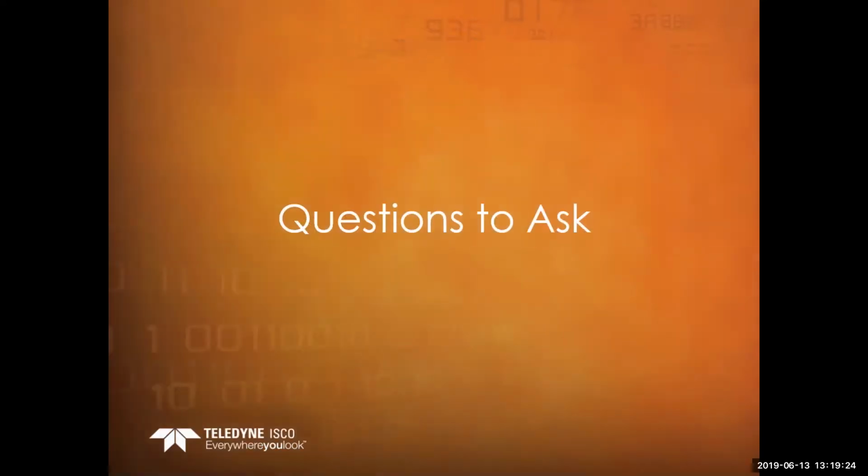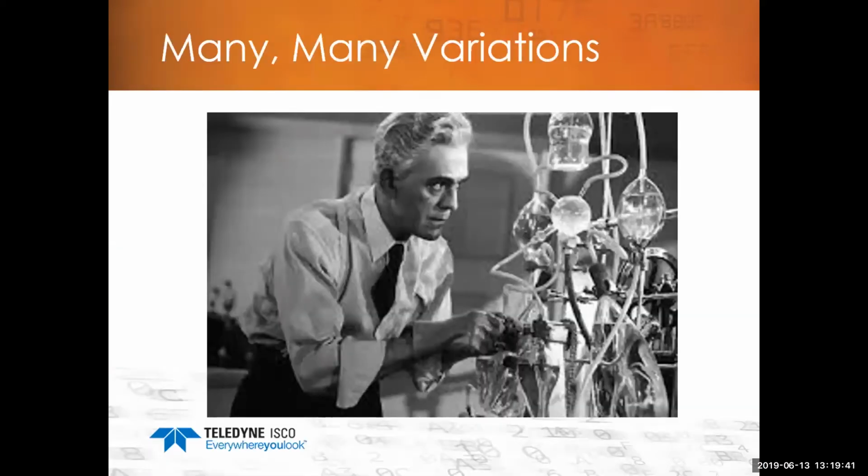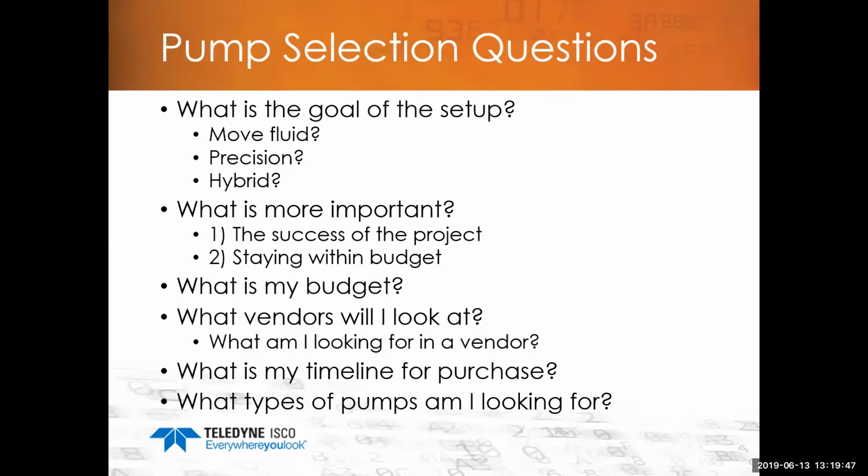So let's take this down another level here, and let's get into some of the nitty gritty. What things should we be asking ourselves, and what features or mechanisms of a pump can affect my flow chemistry process? First off, there are many, many, many variations, like a mad scientist creating many different types of variations for these products.